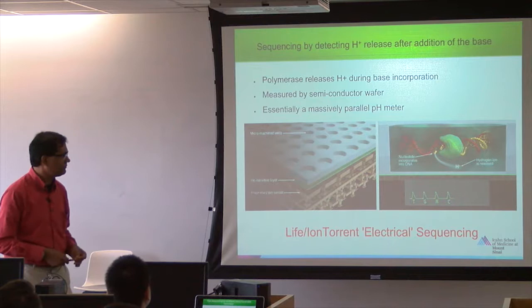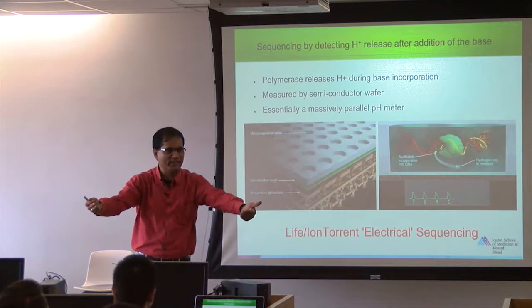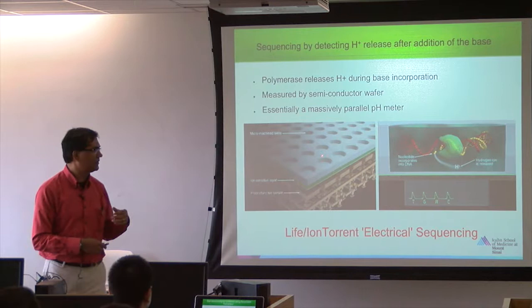Now, the creation of multiple wells, now 10 million wells, 15 million wells, 20 million wells, makes it much cheaper and faster, because if you increase the wells, it becomes faster and cheaper. So what do we do now? That means we have to move beyond this wells concept. Right? What do we do? Any idea? No wells. Remove those wells. What do we do by removing the wells?